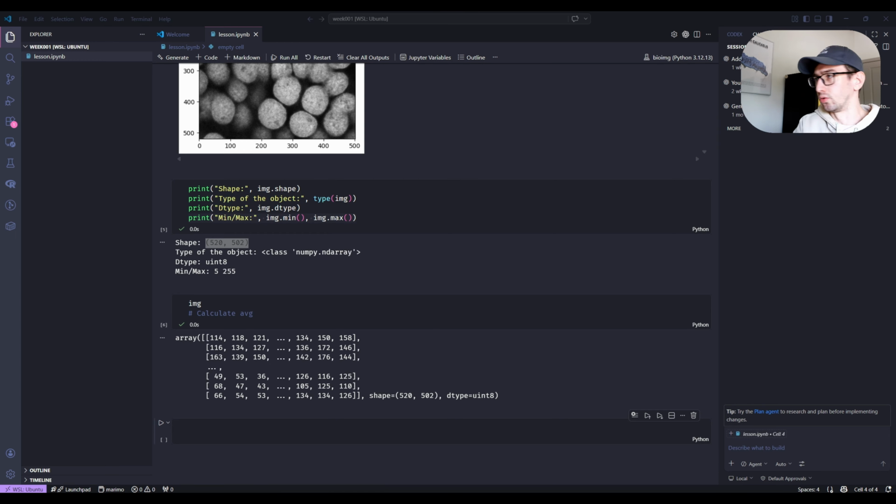Then basically you should know all this: you can calculate the average by using some built-in functions, or if you want, you can implement your own. And then there are some masks which you can use inside of Python. Do we need to calculate the average per row, or just as a flattened array, like the default NumPy mean? So we want to calculate the average of the whole 2D array. Yeah, and there is a function.